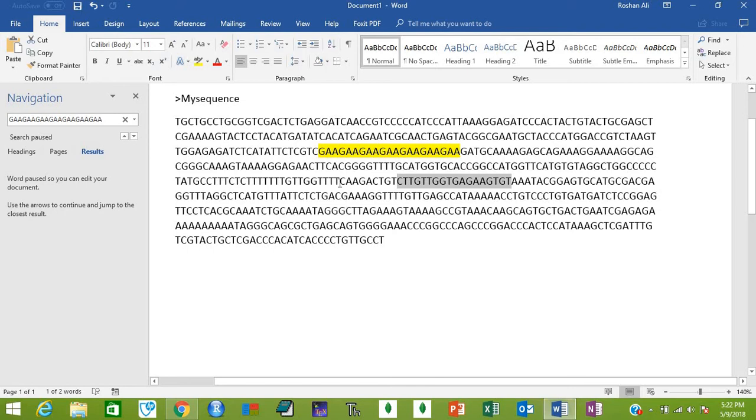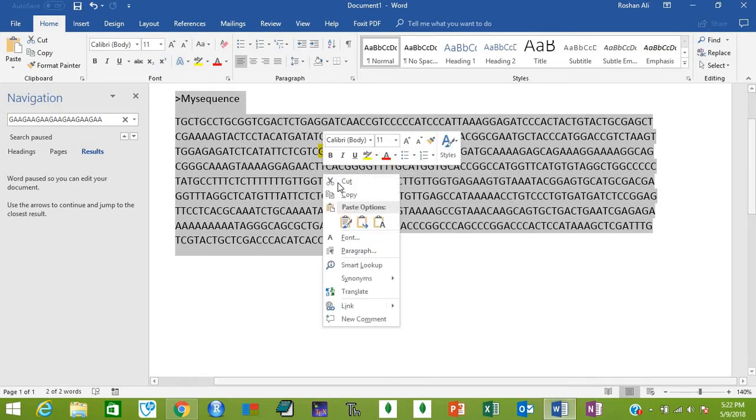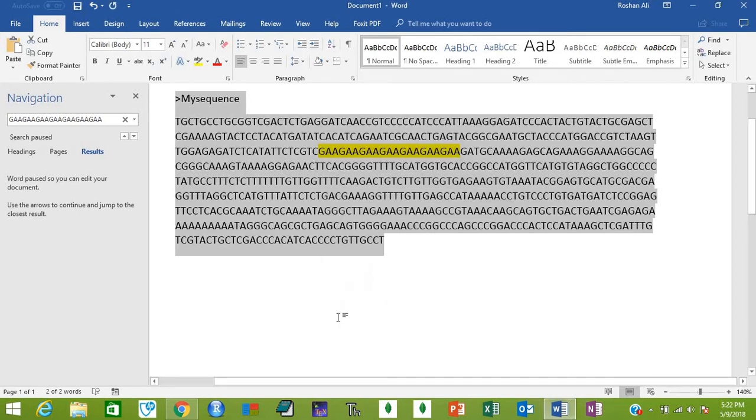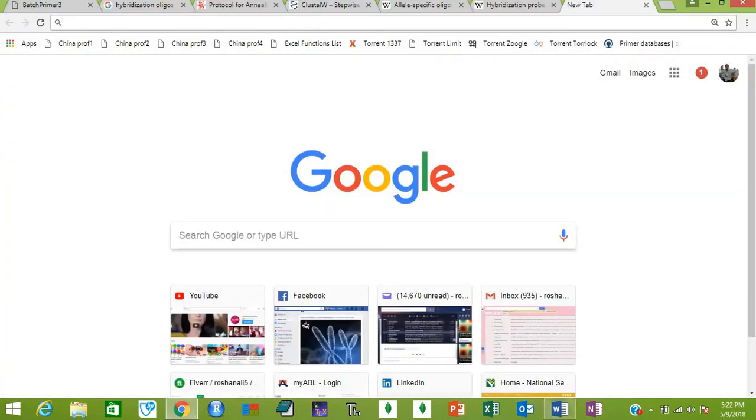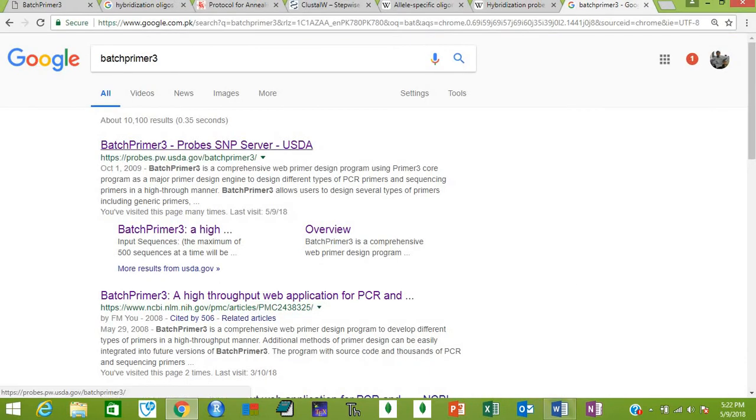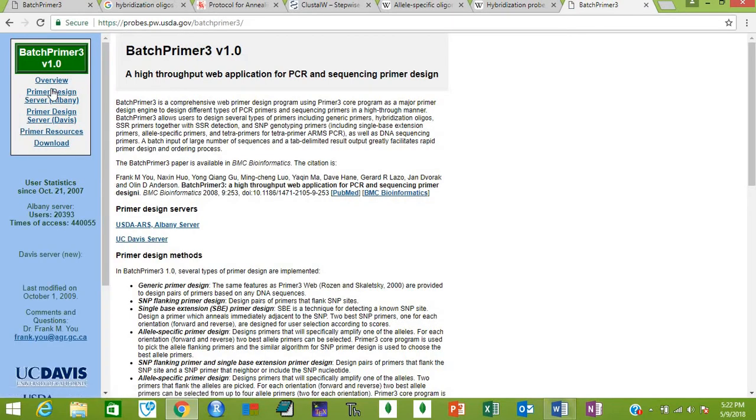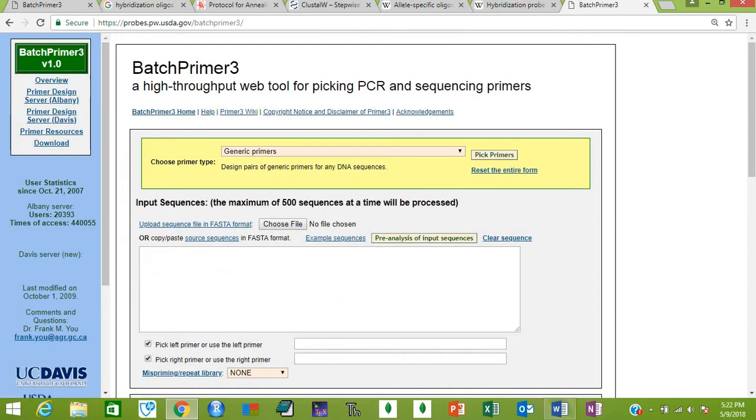Let's start. First of all, copy your sequence, then type Batch Primer 3 in Google. Click on this website, Batch Primer 3, and then go to primer design.